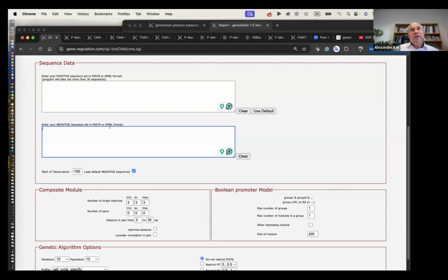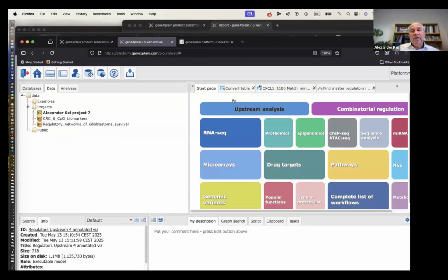Now the first question was how to extract those promoters, and that can basically be done also here in the free platform.